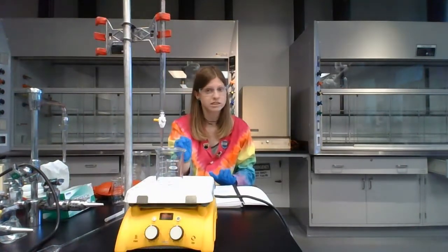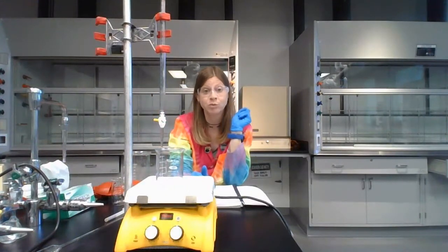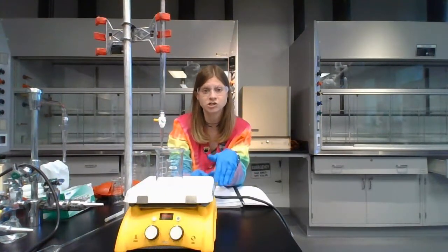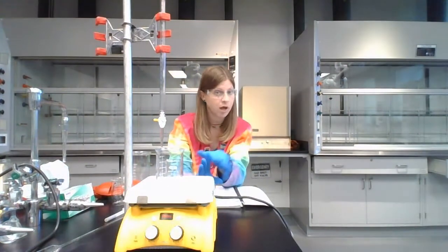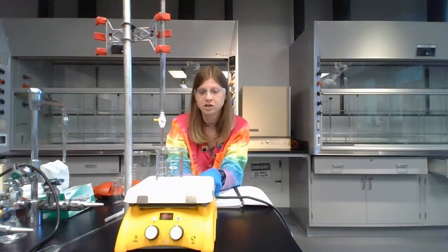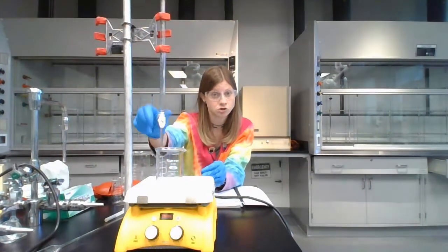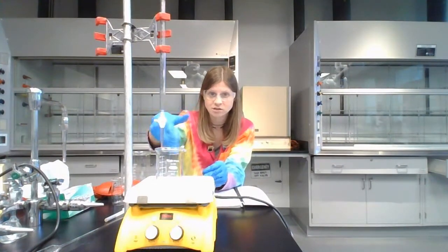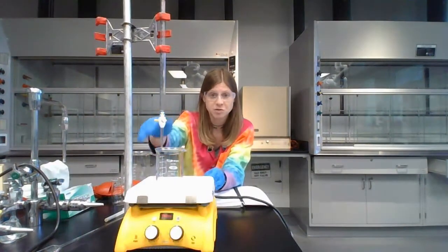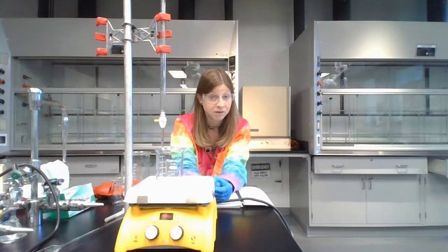Now, once that's happened once, continue adding the potassium permanganate, but the second time the color changes is when we need to stop. So the color change is going to go from a clear, colorless liquid to a light pinkish purple color. That light pinkish purple color is our endpoint. So just like with our acid-base one, once you start seeing a hint of color show up down there, stop letting the liquid just drain, and instead add a small amount at a time. Let it stir, see if the color shows up. If the color disappears, add another small increment. We want this to be the lightest pink purple color we can possibly get.